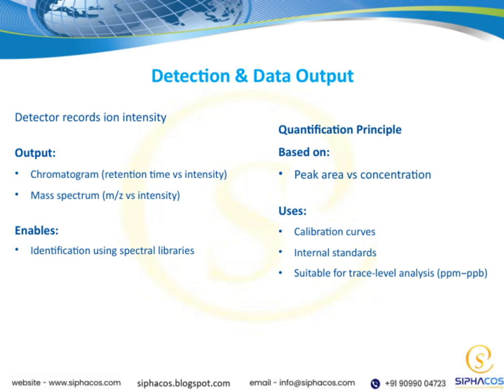Overall, this quantification approach ties together the measurement, detection, and identification steps, providing a comprehensive way to analyze and understand the composition of our samples.